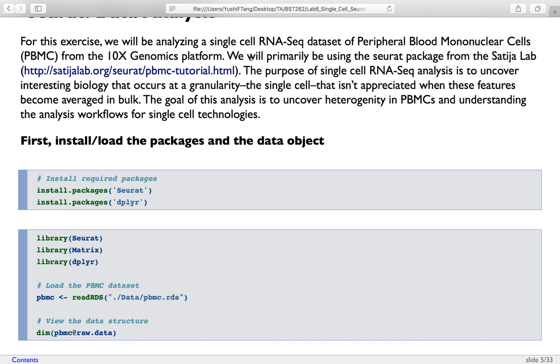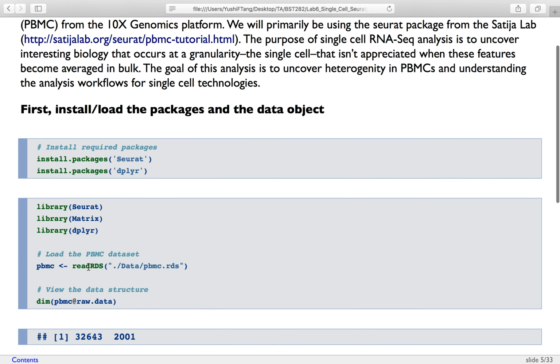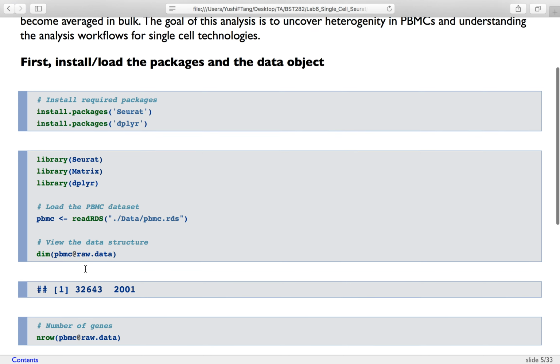They have a tutorial for this one, and you can go to their website to check. They just updated their software from version 2 to version 3, so there are some changes. For example, originally they stored the dataset in an .rds object, but currently they have changed the data structure. We can see the new data structure in our homework. Yeah, we can touch on that later. Just pay attention to this command while you are doing homework question 1.